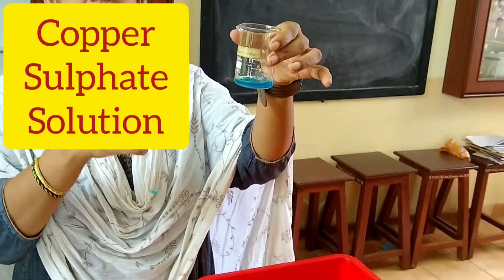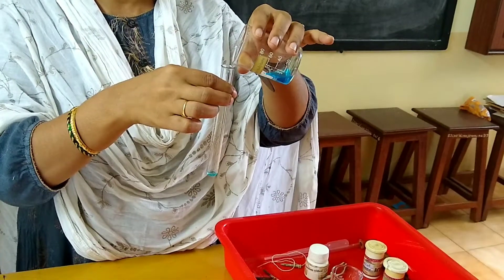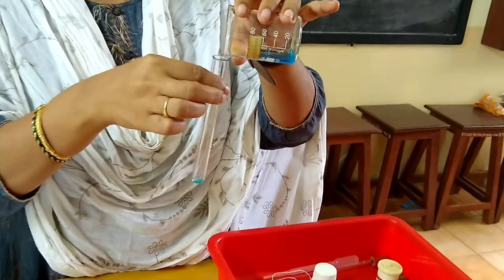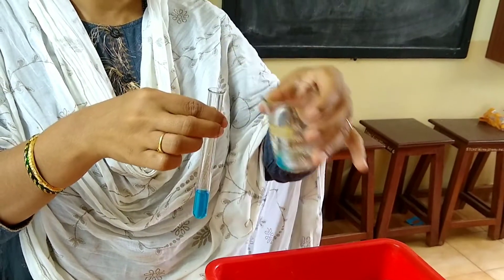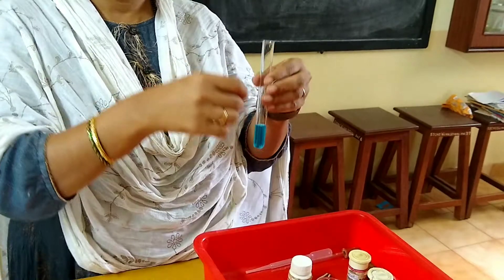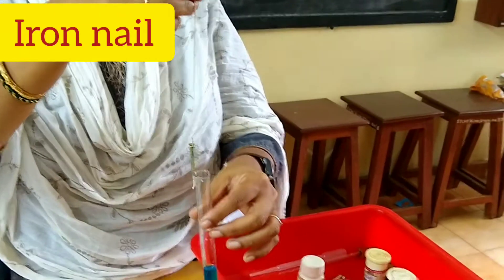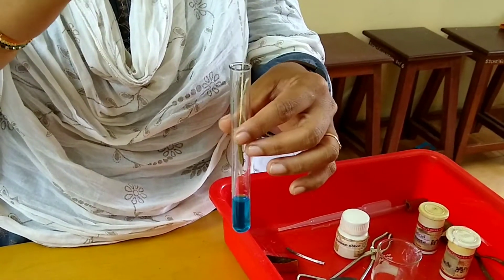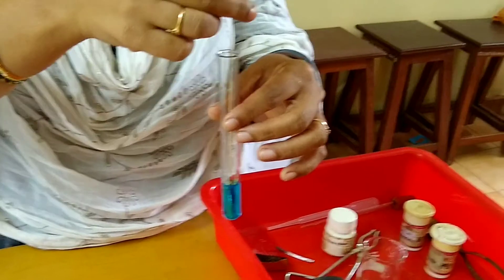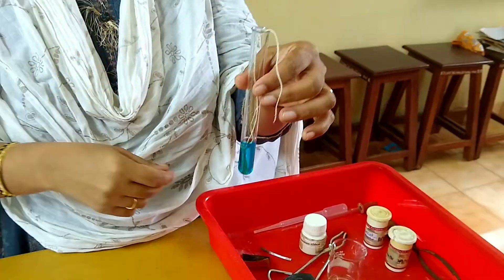This is copper sulfate solution. Take a little amount of copper sulfate solution and immerse the iron nail into the copper sulfate solution.